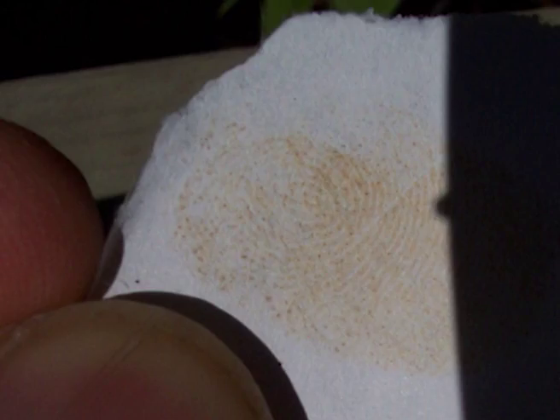After the fingerprints develop, the article should once again be washed with water so as to remove excess of silver nitrate. Otherwise, the silver ions adhering to the surface are slowly transformed to metallic silver. As a result, the entire surface gets stained and consequently the contrast between the developed print and the background is substantially reduced. Nevertheless, the staining of the background cannot be completely avoided.